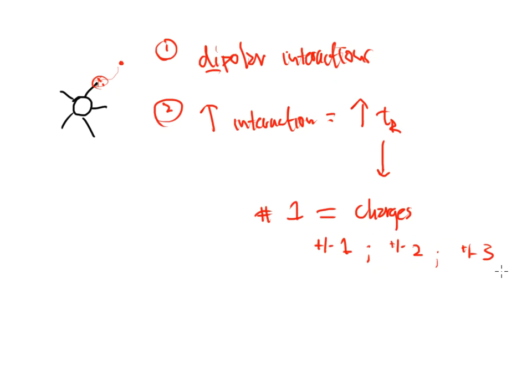It also doesn't happen this way on a general run-of-the-mill group or family that we're talking about. There's always exceptions to the rule. But if I had to oversimplify it and give you an idea of order of elution, then this basically is kind of the number one thing that we can talk about. But charge is not the only thing that we have to worry with.